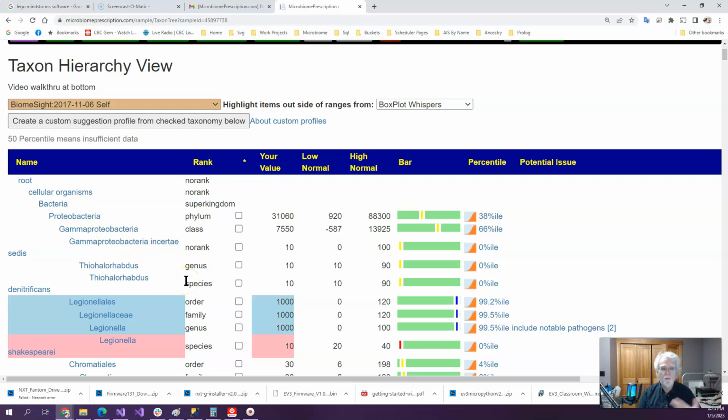It starts saying, oh, fish is good for you. If it's a puffer fish, which is poisonous, it's not good for you. If it's salmon, probably not bad. If it's oily herring, you may have problems with taste, etc. But the main thing is when you get here, you want to take a look here, and what you want to check is to make sure that we see percentages here.